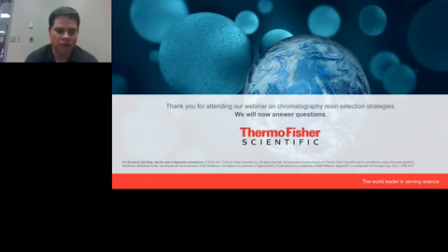So like a 100 microliter settled volume of magnetic agarose is going to have more beads than a 100 microliter settled volume of traditional agarose. So potentially you'd have a higher cumulative surface for your target to bind to.